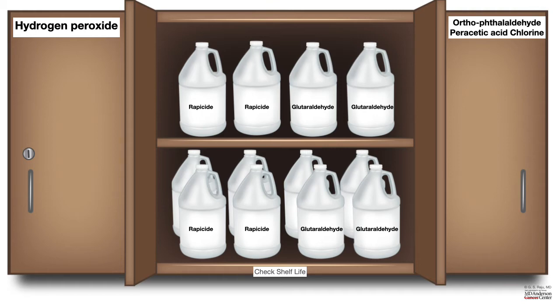Once you've opened it, and then you may have to use it again, in that case, make sure you check the use life. So when you open, you need to put in your date and signature, and then looking at the use life, the disinfectant solution should be used before a particular amount of time, otherwise it will be ineffective. So these are two important principles: shelf life and use life.